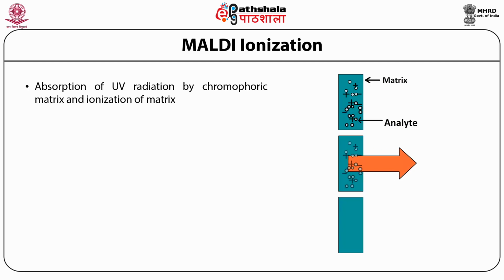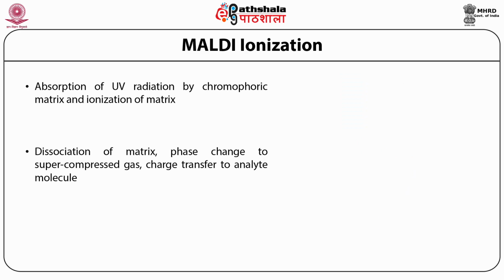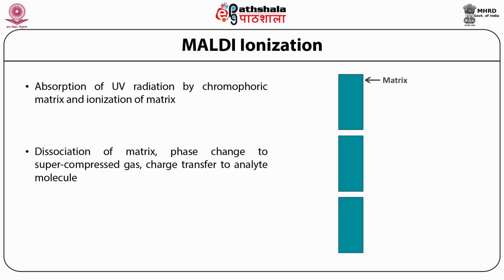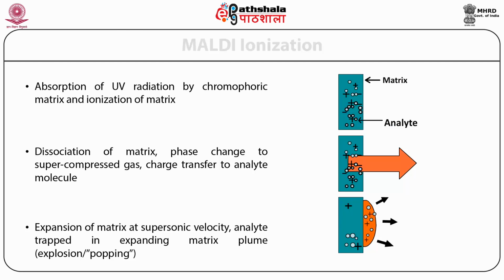In the second figure, you will find dissociation of the matrix, a phase change to a supercompressed gas, and charge transfer to the analyte molecule. In the third figure, you will find expansion of the matrix at supersonic velocity and the analyte trapped in the expanding matrix plume, which we call explosion or popping.